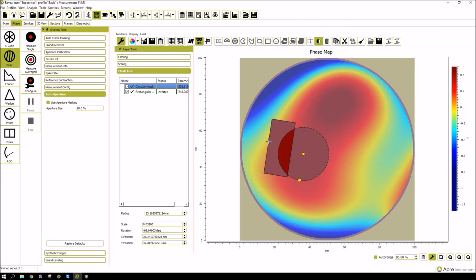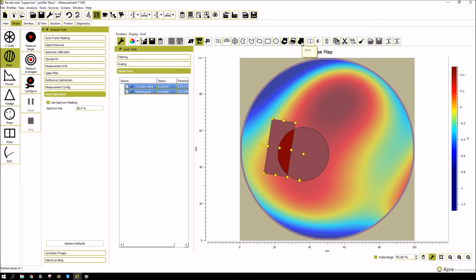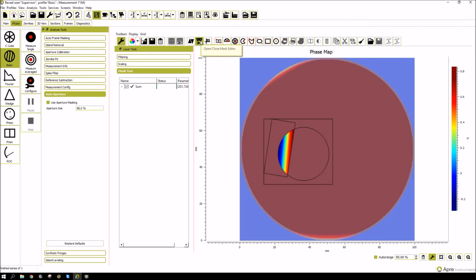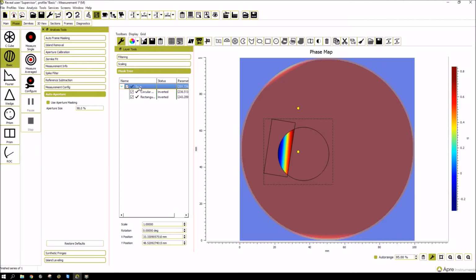So in a sense, this looks like a union, which you'll see if we did a union of these, which is a sum, you end up with only this small area, which is the areas in combination which are not excluding. So if you want to sum two inverted masks, which are the includes, the proper approach is the intersection, which is De Morgan's second rule. And so let's take the sum and we'll break it apart.